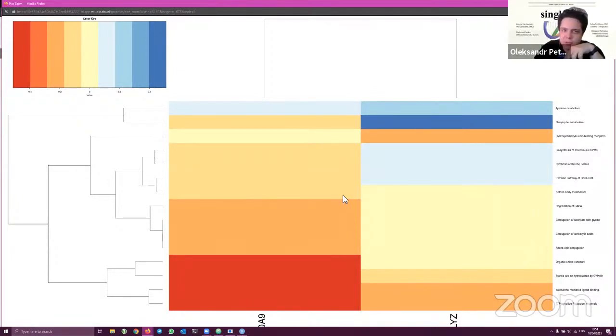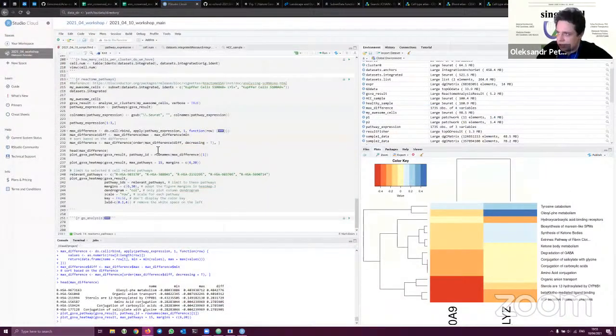And then I would imagine that we can take a look into specific markers in these pathways which are over or hyperexpressed, and then think about how therapeutically valuable they are. So read about them, see if there are any drugs targeting them, and make the next tertiary analysis. Because this is always a secondary analysis.